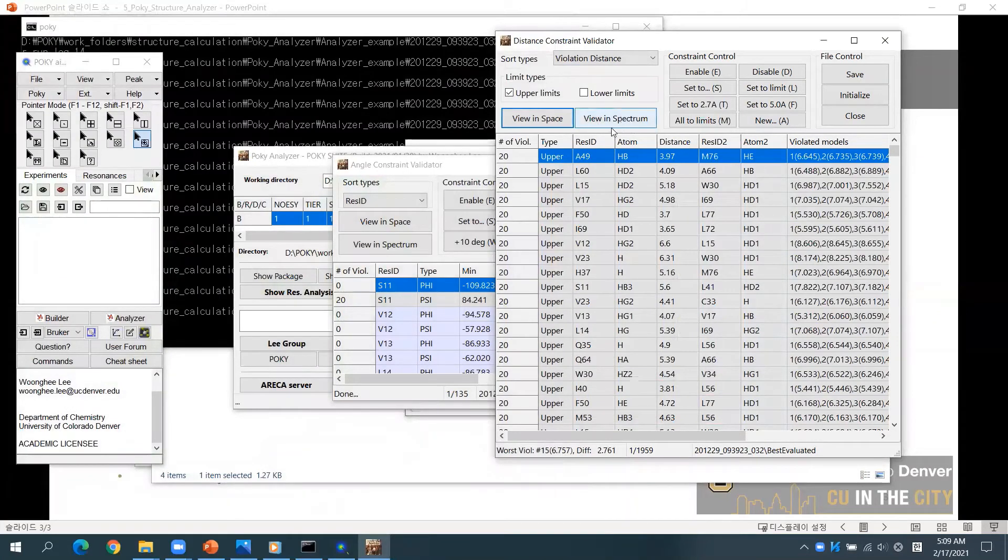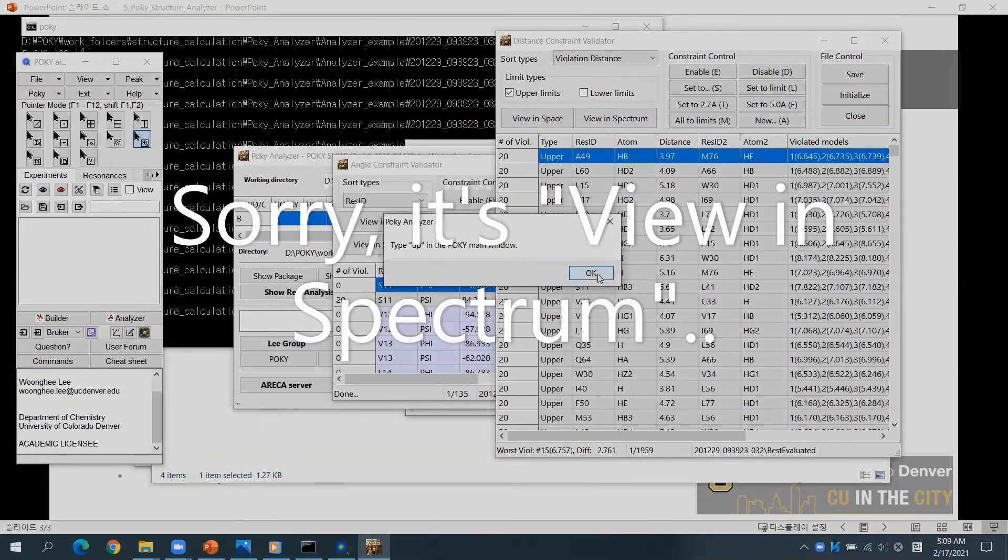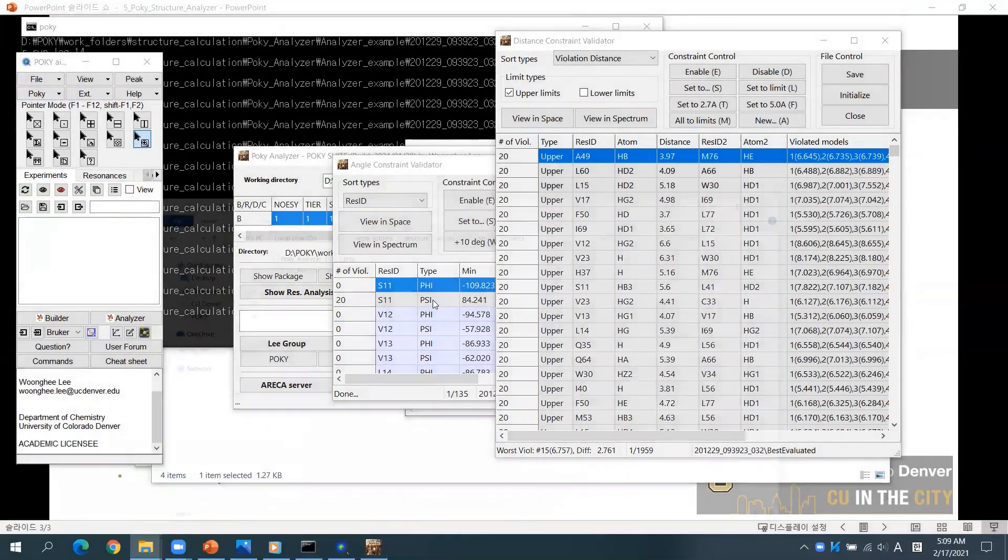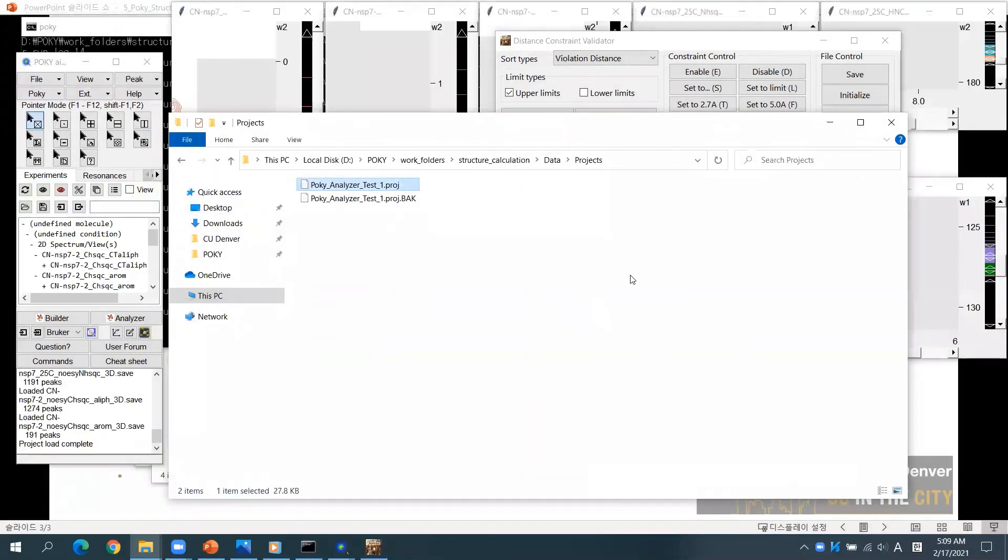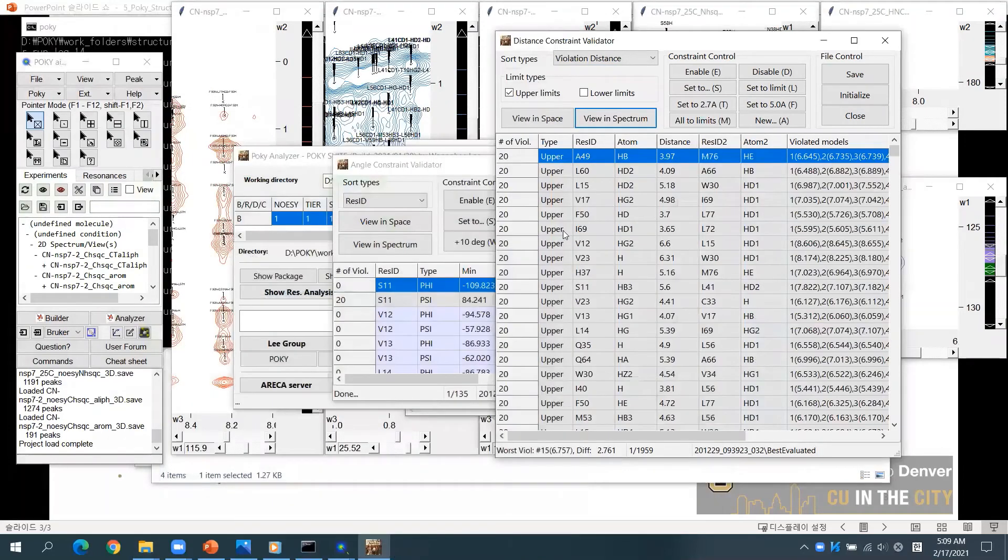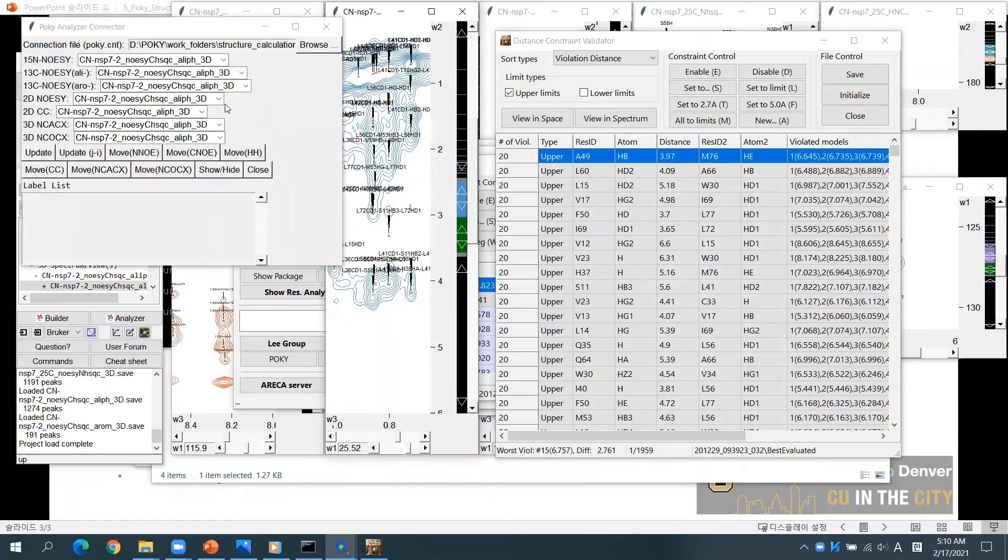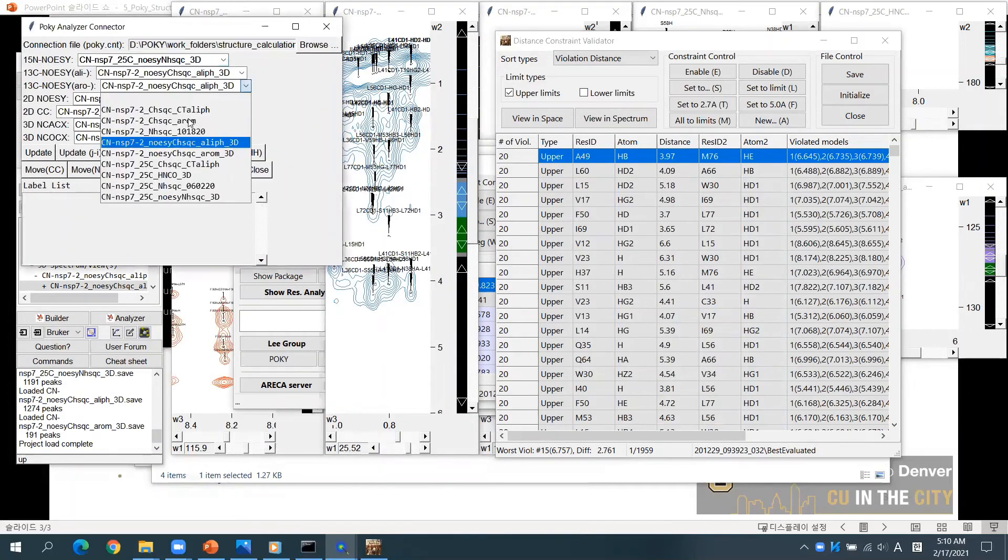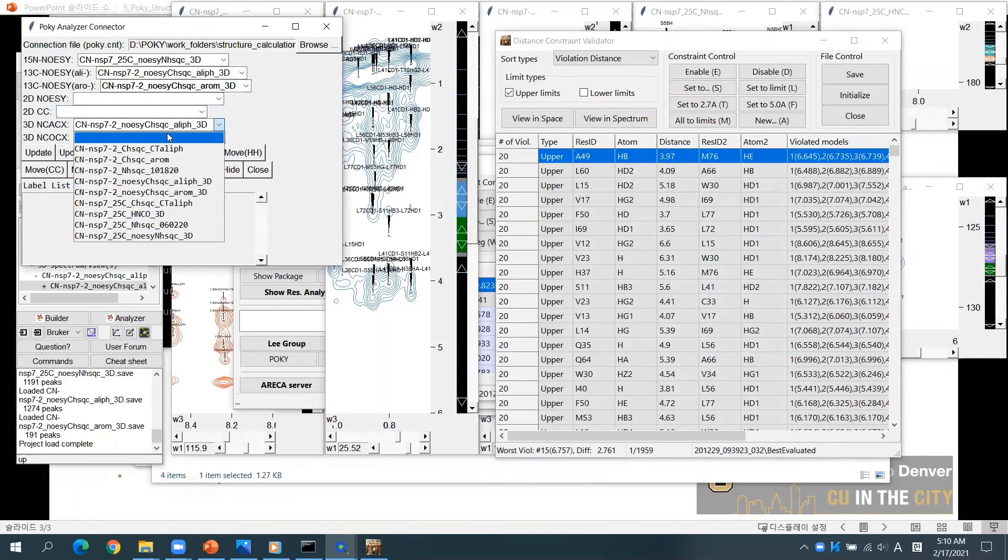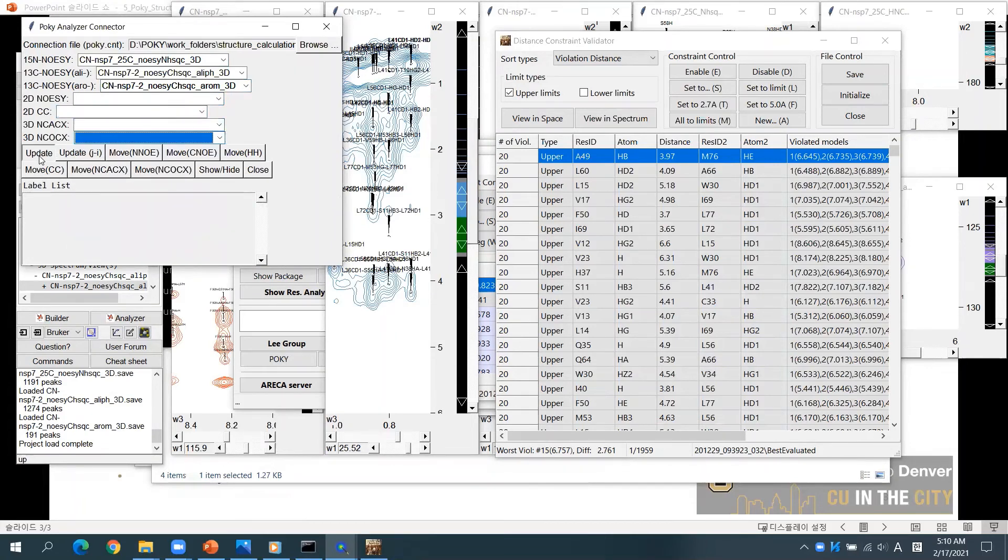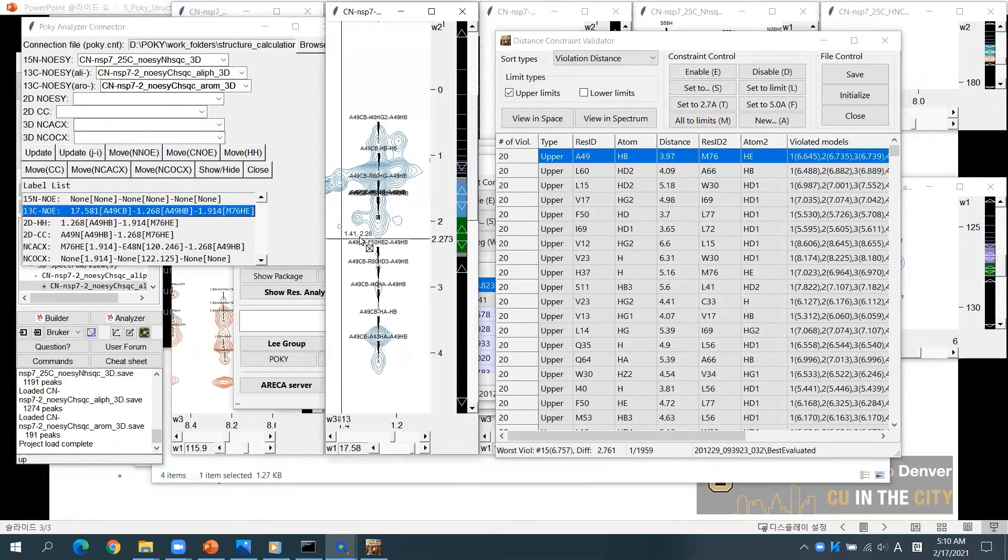Next, click Viewing Space and open the NOESY spectra. Type UP and select the corresponding spectra. If you click Update, you will find the peak that corresponds to the selected constraint.